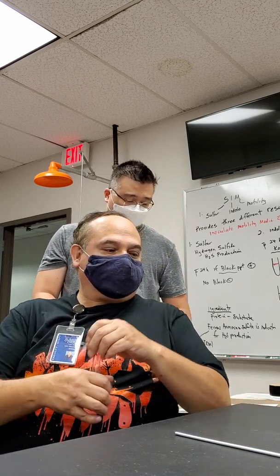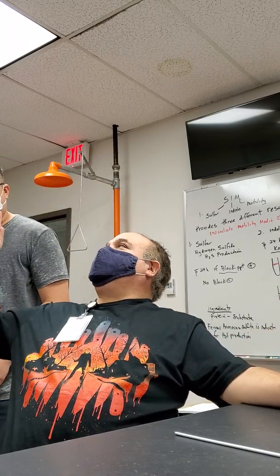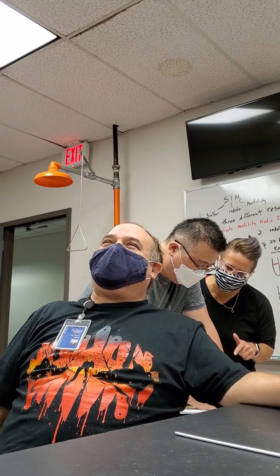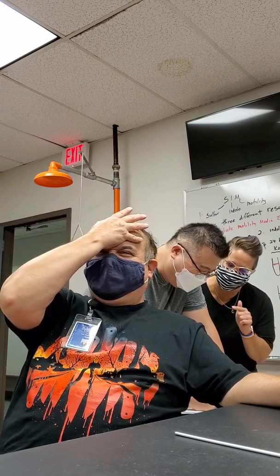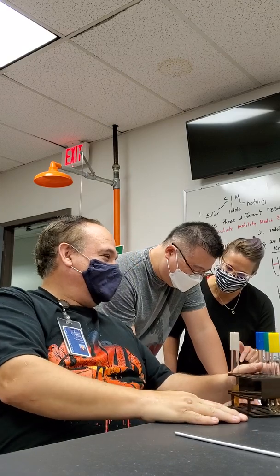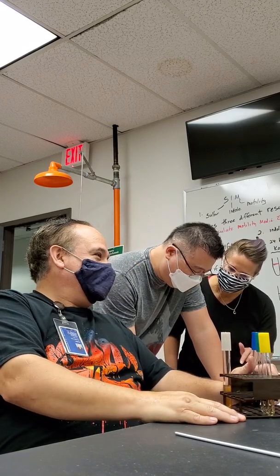Okay? Nice. Questions? Who's going to keep up with this for Angela? What was it? SSSB, streak the slant, stab the butt. You speak too fast. Streak the slant, stab the butt.